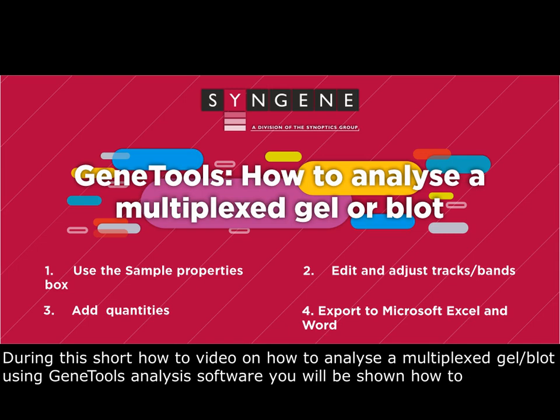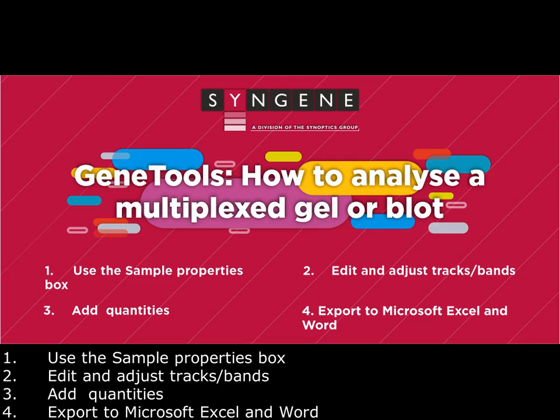During this short how-to video on how to analyze a Multiplex Gel blot using GeneTools analysis software, you'll be shown how to: 1. Use the sample properties box, 2. Edit and adjust tracks or bands, 3. Add quantities, and 4. Export to Microsoft Excel and Word.